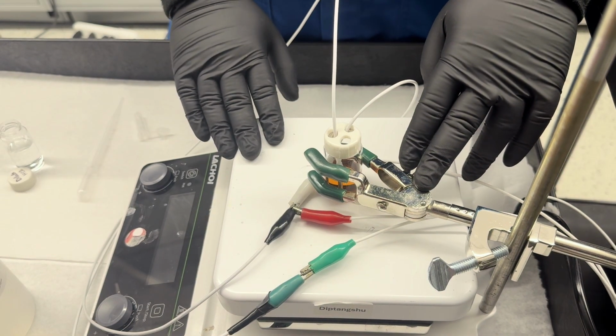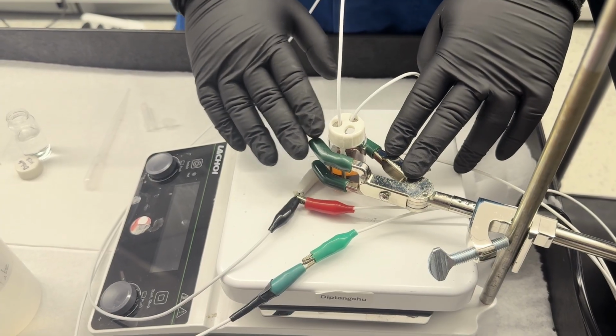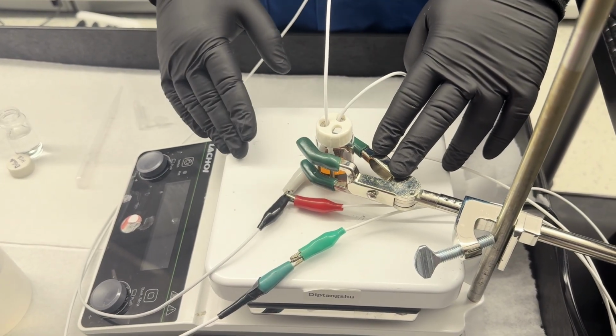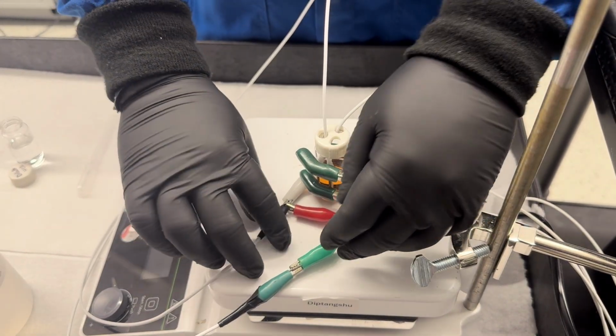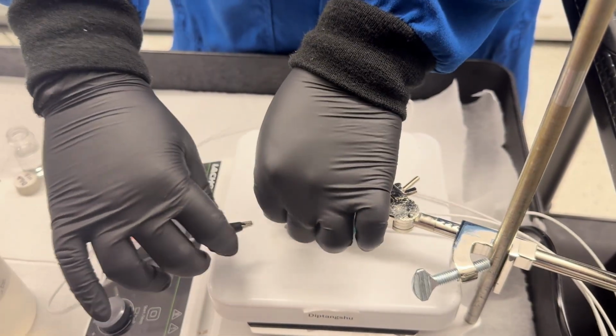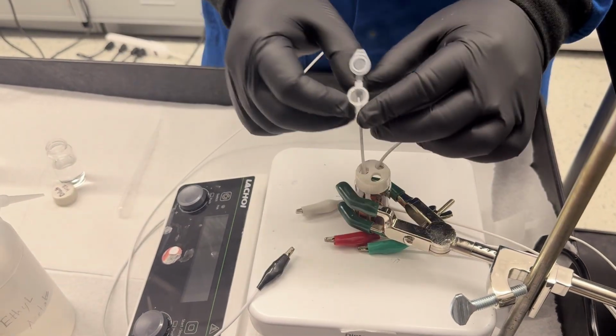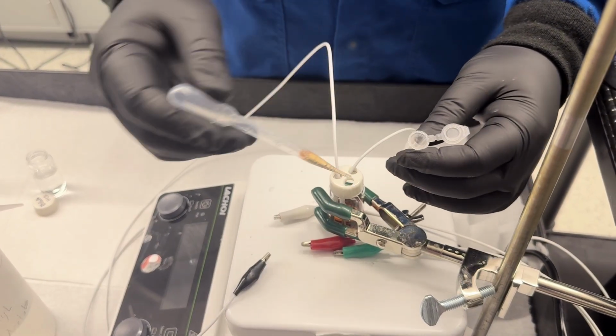After the 16 hours, we can see the reaction is now over, and we can see a change of color here. For the further workup and determination of the molecule concentration, we first disconnect the electrodes and then take 0.5 ml of solution from the reaction mixture.